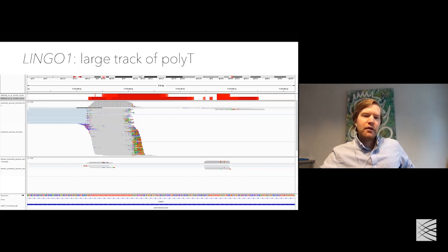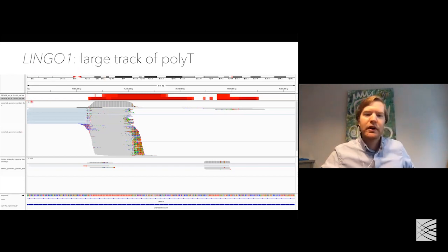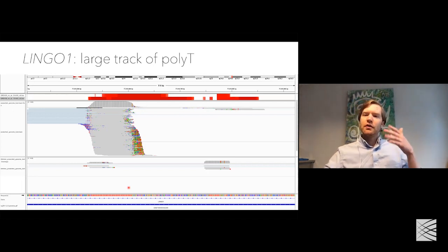And what's going on here is that we have a huge pileup. It's impossible to read this number probably, but there's 12,000 reads aligning to this spot. And if you look at the sequence, what you can see is this is a stretch of poly T. So if you remember, I mentioned that part of this experiment is to use a poly T capture piece of DNA to hybridize to the polyadenylated tail of mRNAs. So already we're thinking, interesting, this could be some kind of technical artifact.